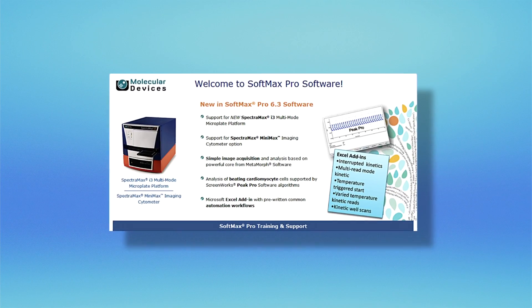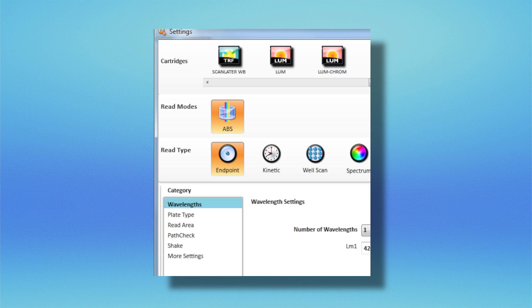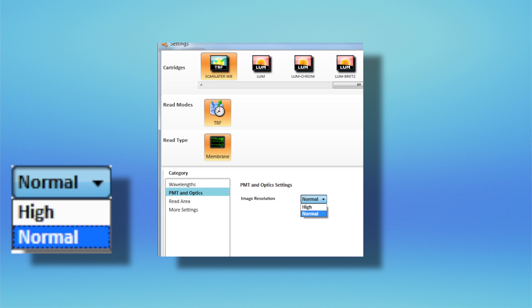ScanLater Western blot image acquisition is managed through SoftMax Pro, the same software you are accustomed to using for microplate detection and analysis. Obtain your desired level of image resolution by using one of the preset scan settings. No exposure time adjustments are required.